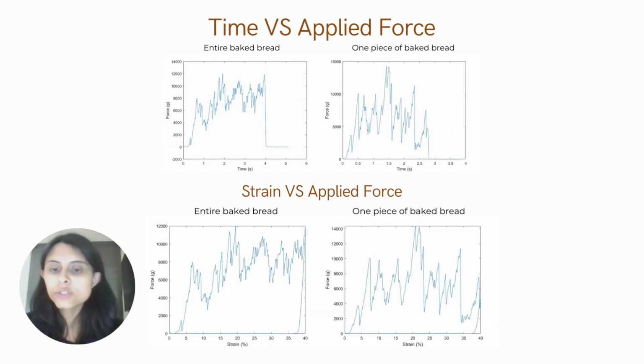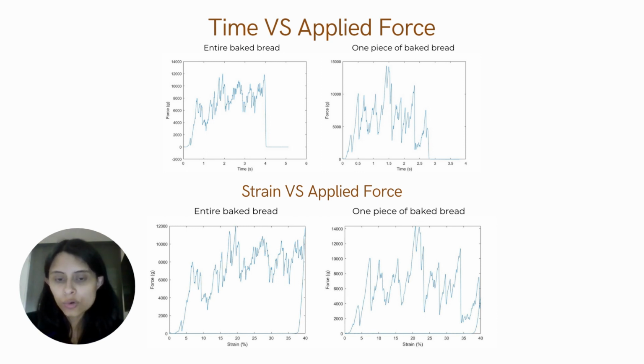With respect to the data related to already baked bread, changes can be observed when the bread is analyzed completely, including the crust, and when only a piece is analyzed. In regards to the force applied to the bread over time, an oscillatory behavior is observed.